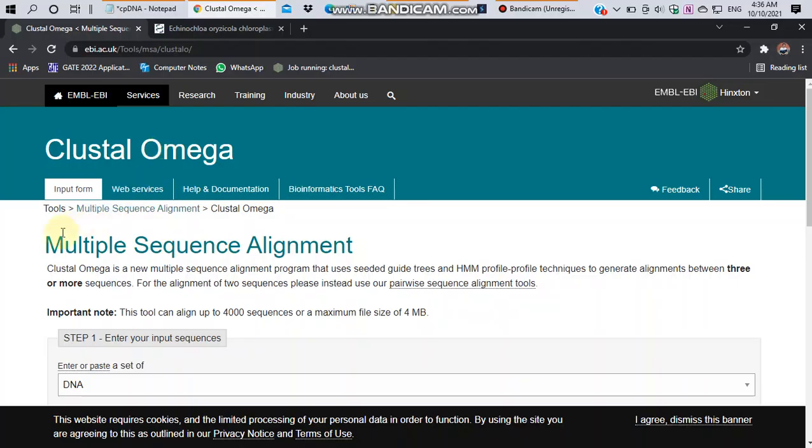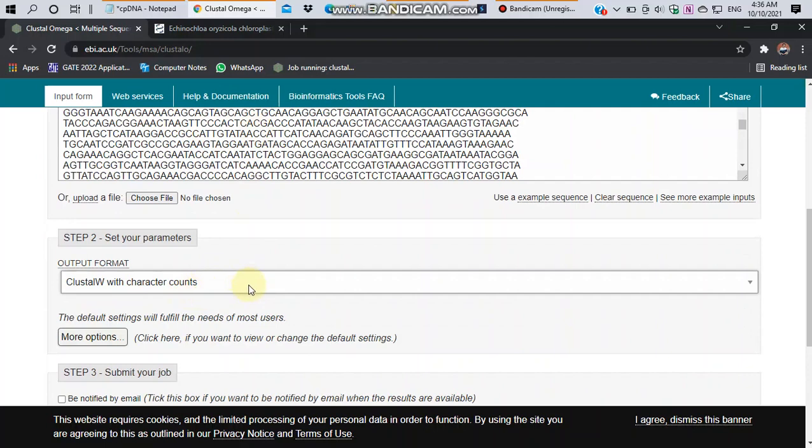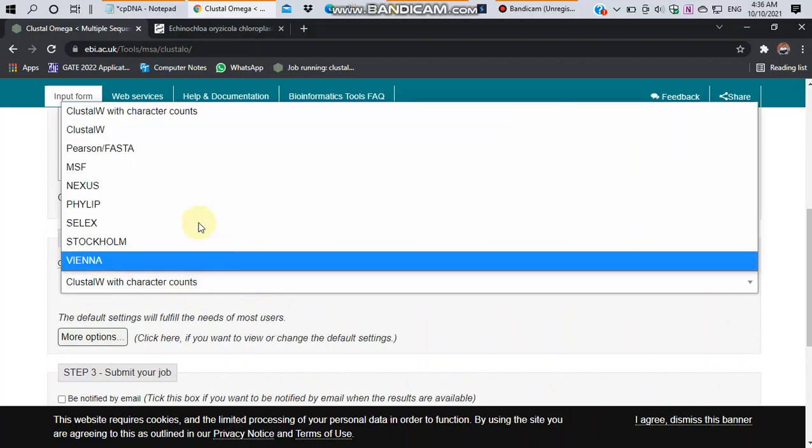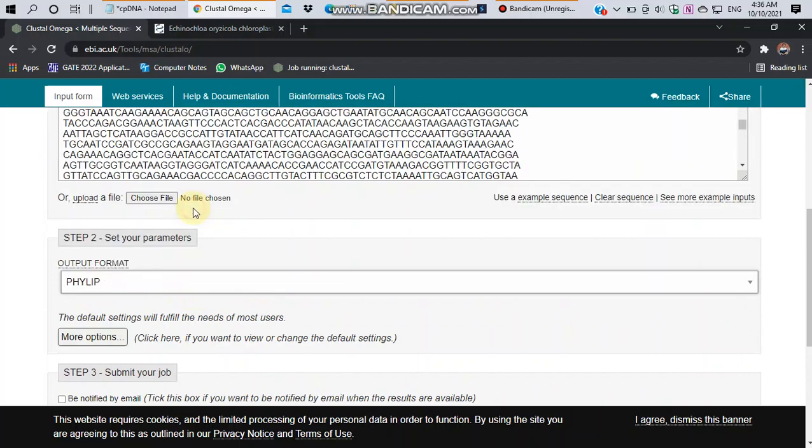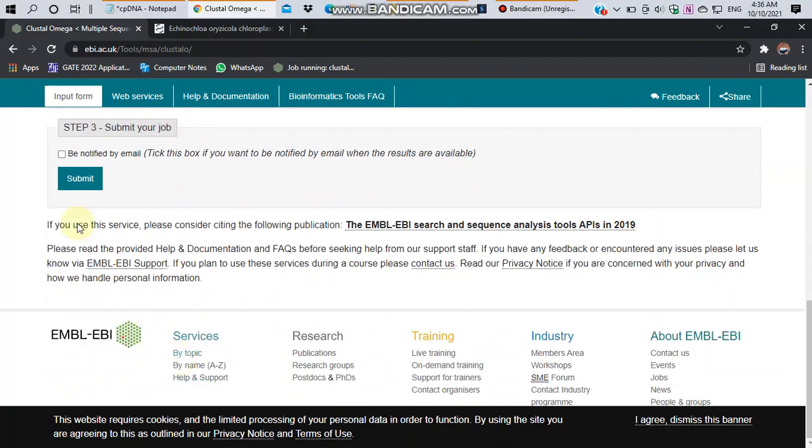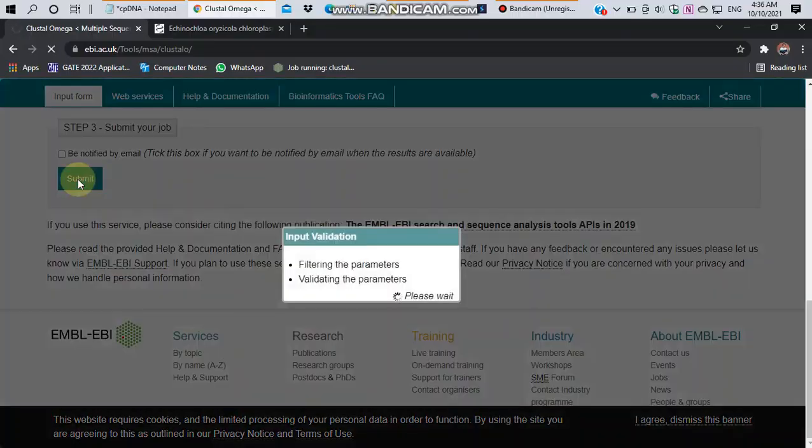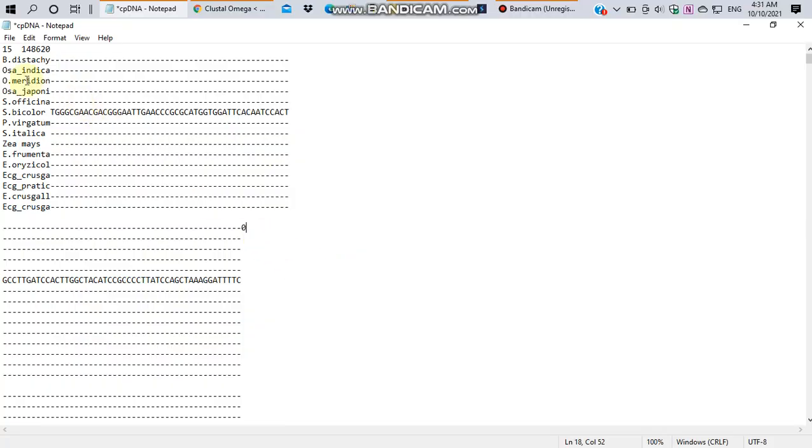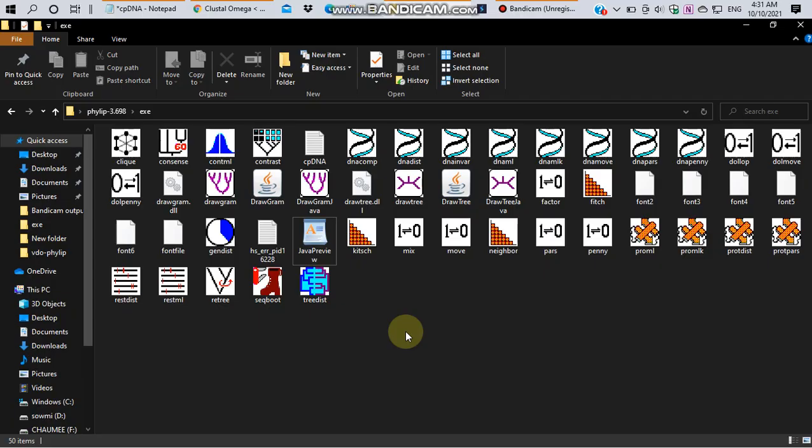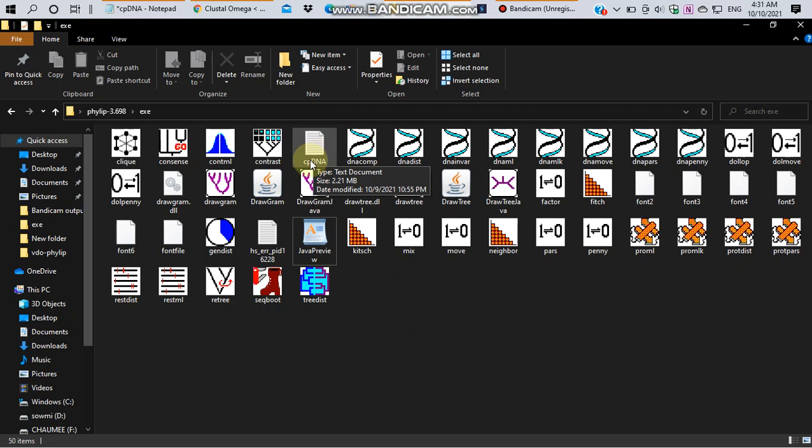I have already performed the multiple sequence alignment in Clustal Omega tool and downloaded the output file in PHYLIP format. This is our multiple sequence alignment file in PHYLIP format of 15 sequences and of about 148,620 base pairs. I store the PHYLIP file in exe file folder as cpdna in text format.